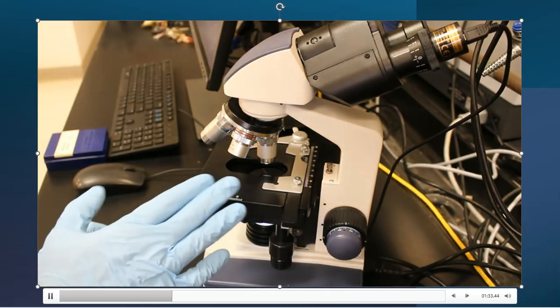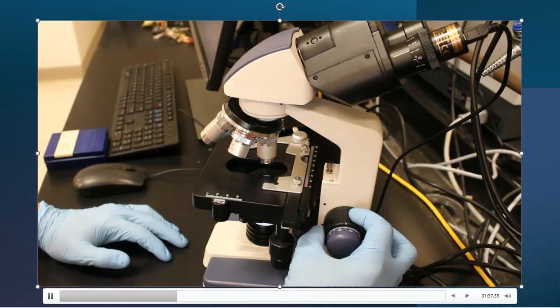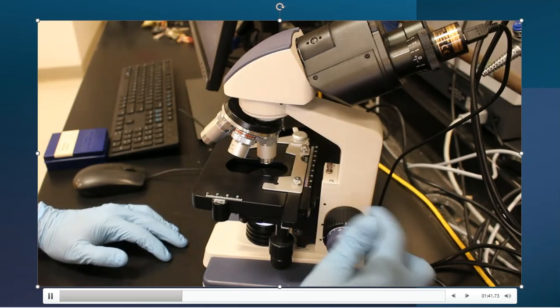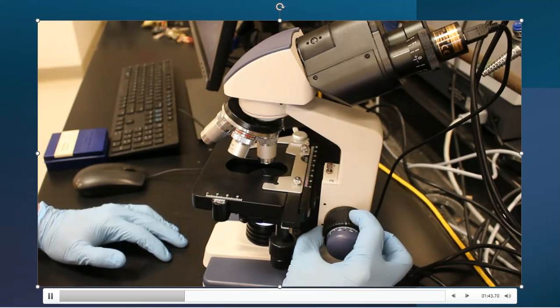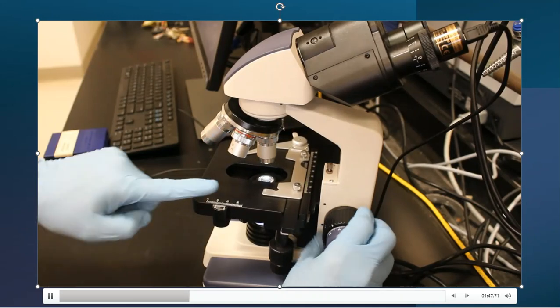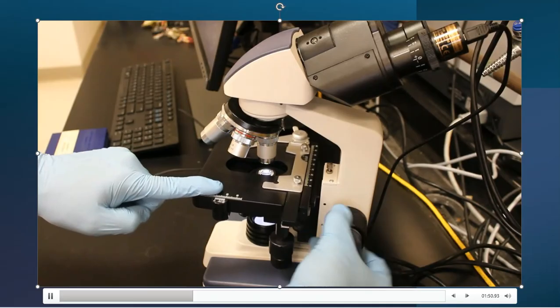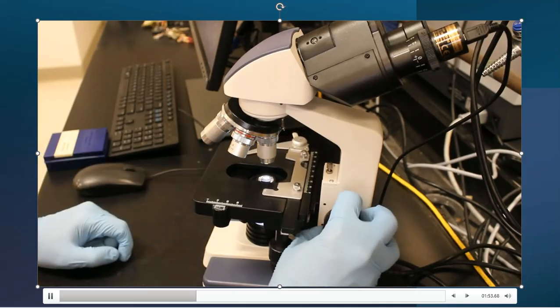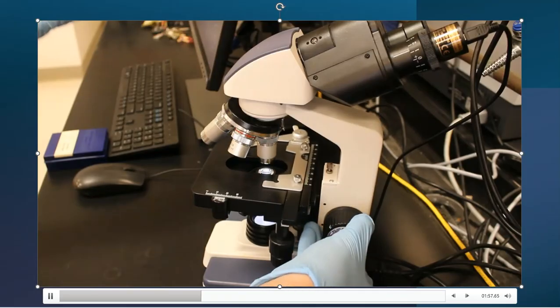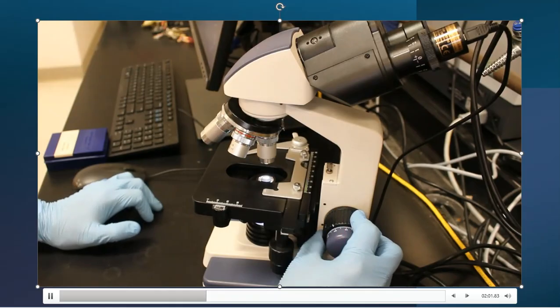Other things about the microscope that you're seeing here, first off is the big knob over here to the side. This big knob here with this particular microscope is just black on the outside. That can actually turn, and what you're seeing is that the platform itself is moving up and down, and it's very rapid. So this is our major adjustment lens. So we can raise the platform up or lower it down quickly in order to zoom in or zoom out of our slides.